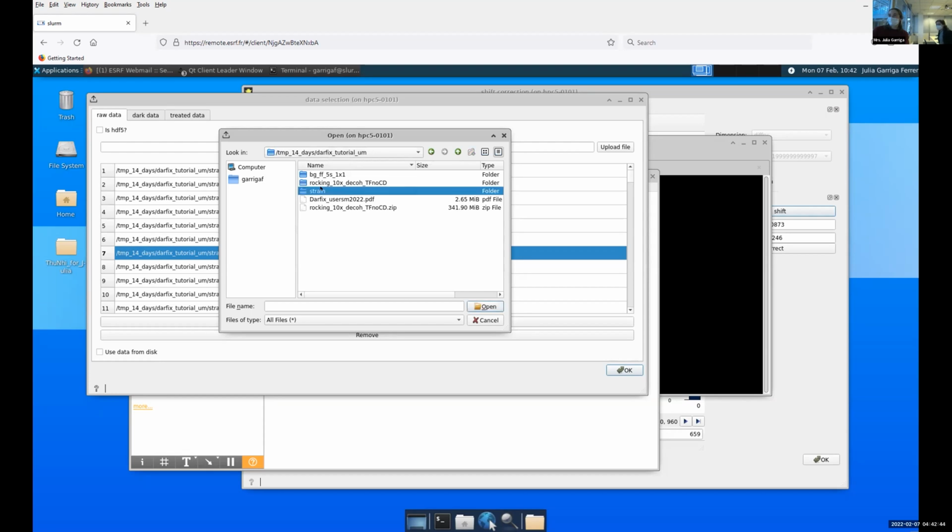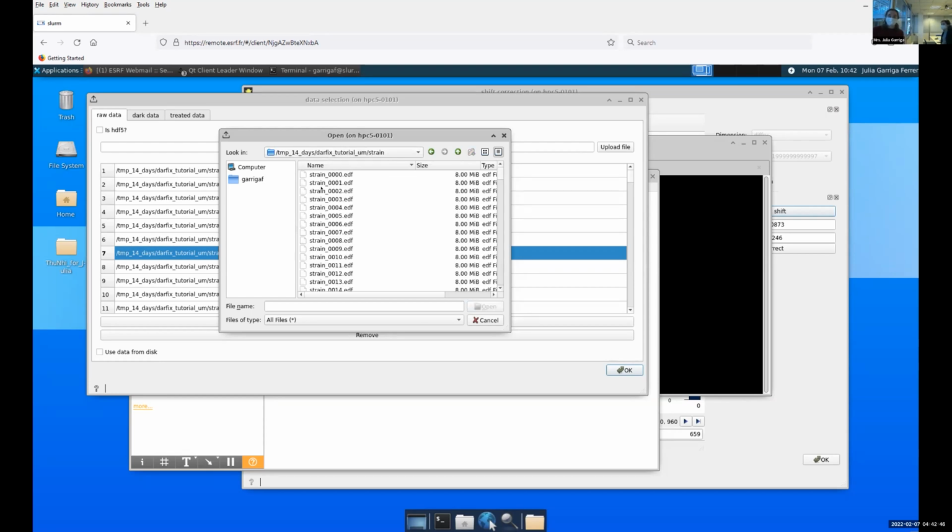On that note, adding the data is order sensitive, meaning if you invert the columns and start adding your files from the last, you will flip your map, and your results will not be like reality. Exactly. It's important that they go from the first value to the last one. If they are ordered, you click Control A.